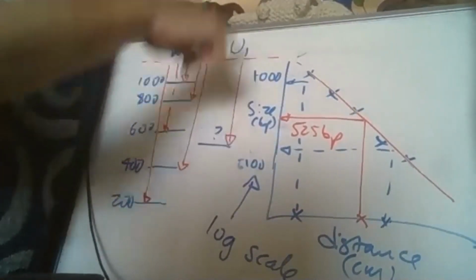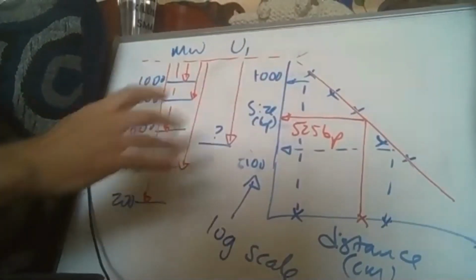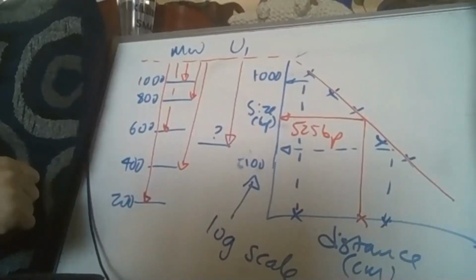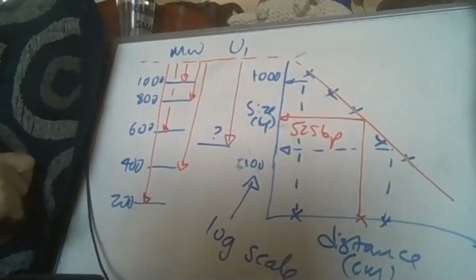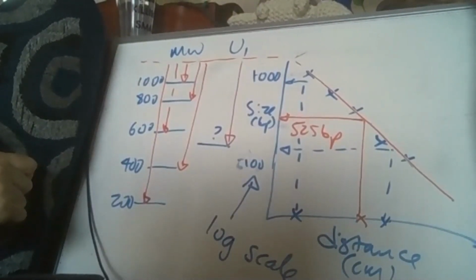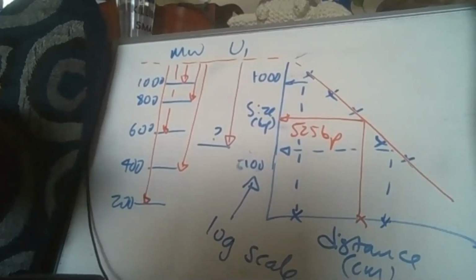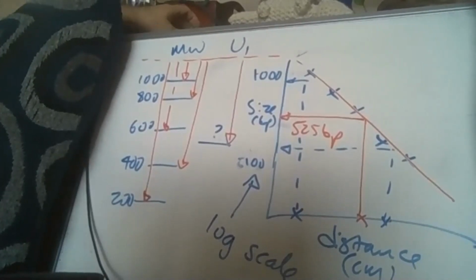So the unknown 1, 2, 3, calculated with a Promega marker, you need to do that again with the Edvotech marker. Because I want you to compare the 2, see which you think generates the most accurate estimates. And if you look on Blackboard, you're actually given the actual sizes as supplied by the manufacturer.